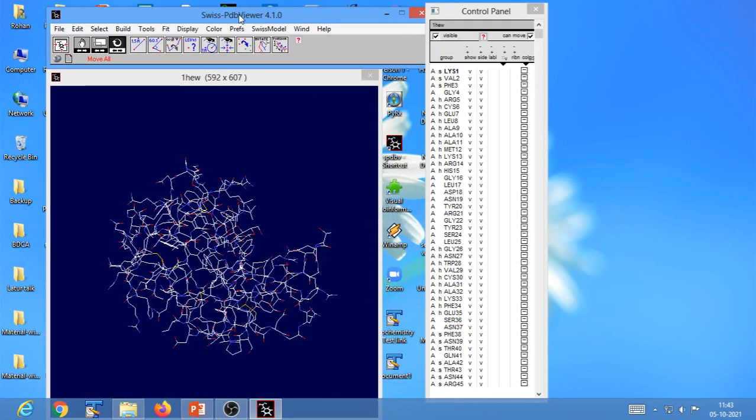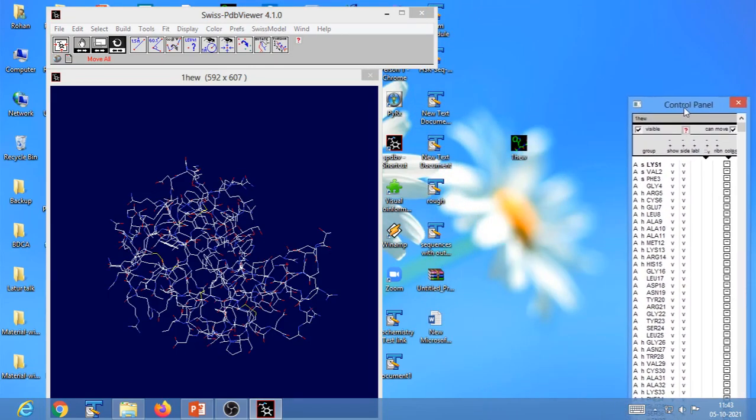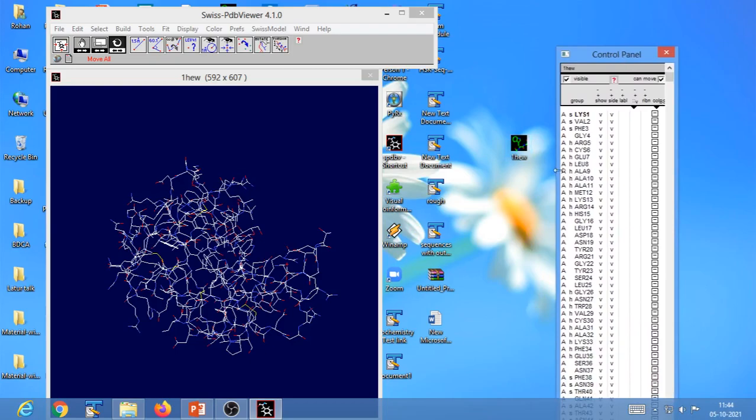We would start out by looking at the enzyme lysozyme in complex with a trisaccharide inhibitor. We would further refer to this inhibitor as trinag. The atomic coordinates of this model are contained in the Protein Data Bank file with code 1HEW. I also demonstrated in our previous lecture how to download this protein molecule from the PDB website. To begin with, the very first objective of today's demonstration is to teach you how to select and display the molecule in different ways.